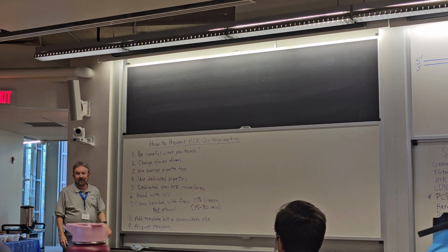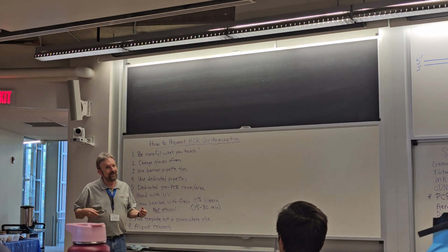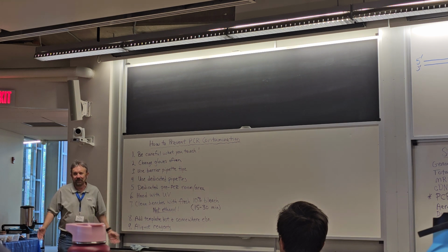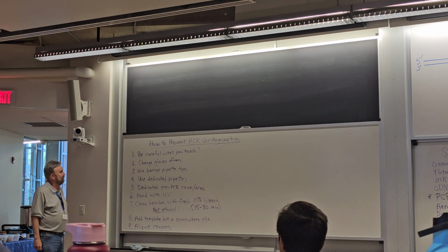You always want to be hyper aware of what you're doing, right? If you do touch something, then change your gloves, right? In terms of money and in terms of waste, it's better to change your gloves than to ruin a bunch of PCR reactions that you're setting up. So change gloves whenever you think it may be necessary.